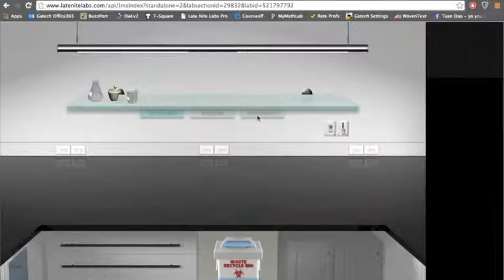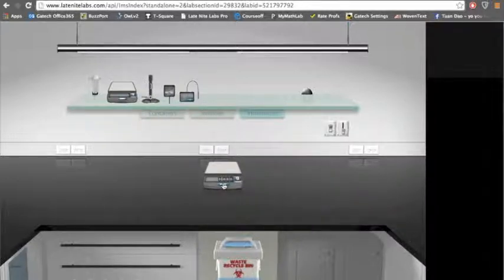We are in Chemistry 1310, Section L01, and today we will be covering Experiment 1 on synthesis. The first step is to go into the instrument shelf, take the balance, and put it on the workbench.